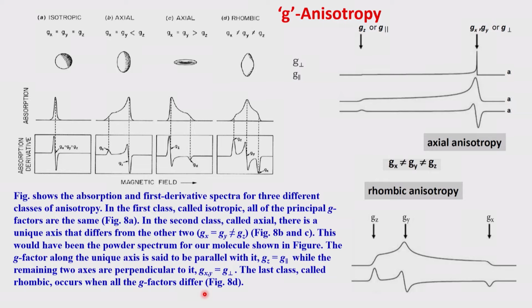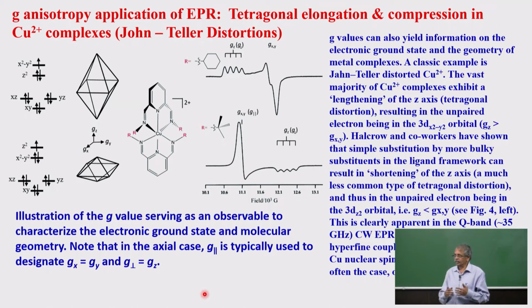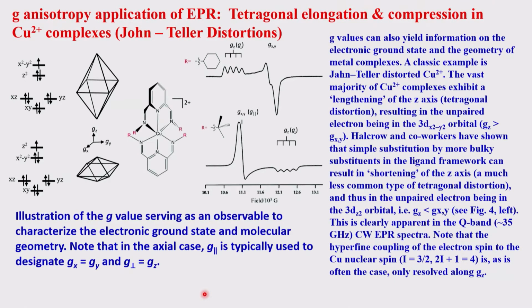Now to understand all this, let us start doing some examples. Let us do an exercise together in the interpretation. These are all interpretations I will be giving, but please join actively in understanding these things, because everything is involved in this interpretation. Just the spectra will not tell you the things unless you follow what I am talking about, and they are very logically spoken, so it is very easy for you to understand this.